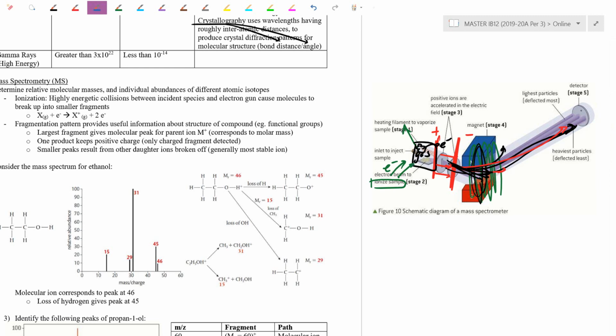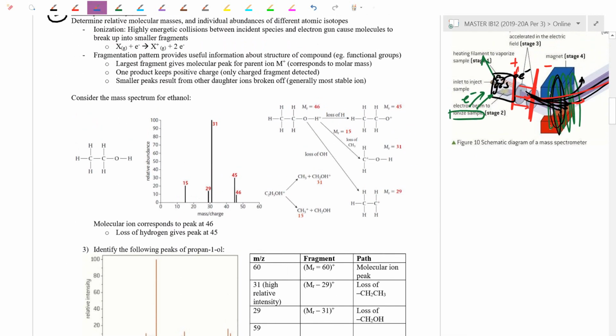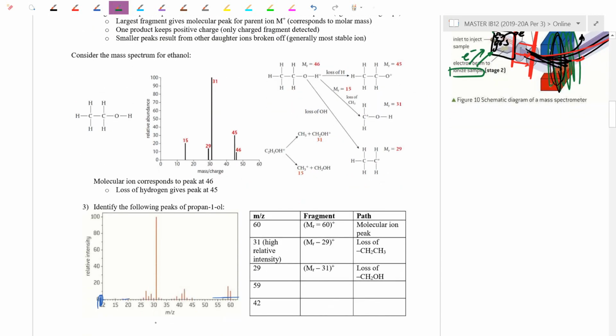And all I do at the end, I might need to amplify the signal, is count how many hits there are based on each setting. When I do that, I end up with what's called the mass spectrum. This is sort of like no deflection, and it steadily gets stronger. It is plotted against what's called the M per Z, so it's a mass per charge ratio.